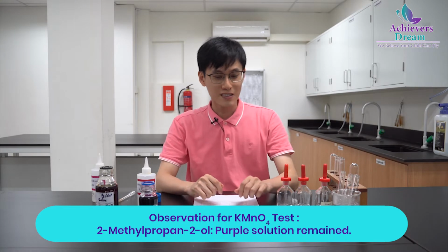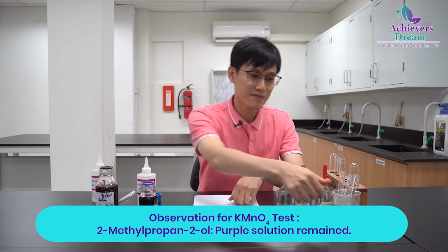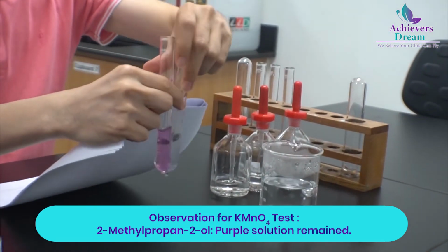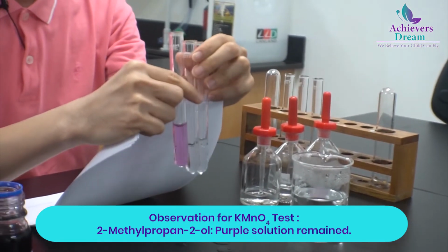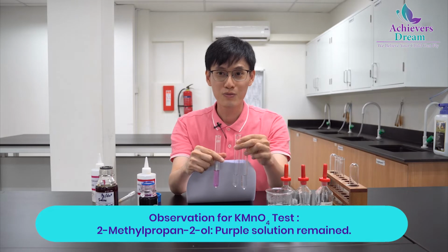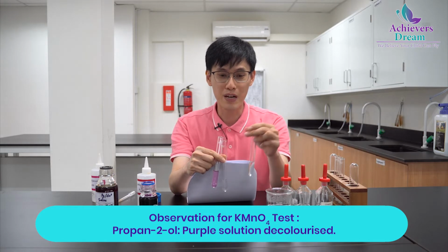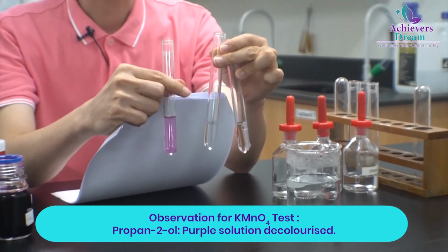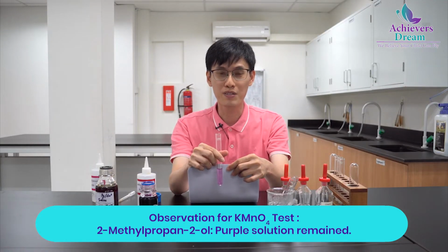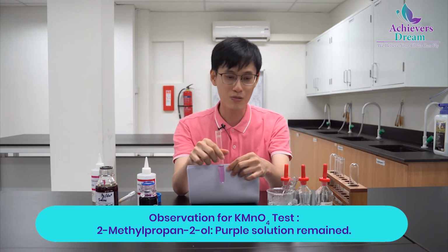Okay, so now let's do a quick check on our 3 test tubes in the KMnO4 test. As you can see, the decolorization is observed for ethanol and propan-2-ol, which can be oxidized by KMnO4 because ethanol is a primary alcohol and propan-2-ol is a secondary alcohol. But the last alcohol, 2-methyl-propan-2-ol, is a tertiary alcohol which is resistant to oxidation. That's why the KMnO4 solution still remains purple.